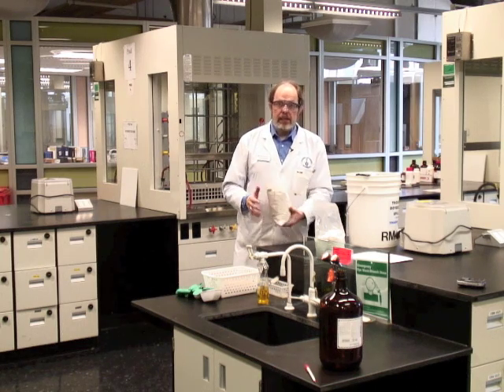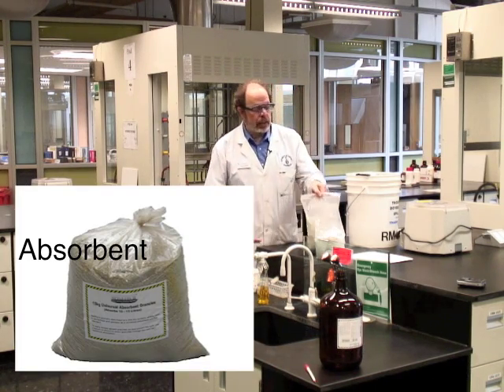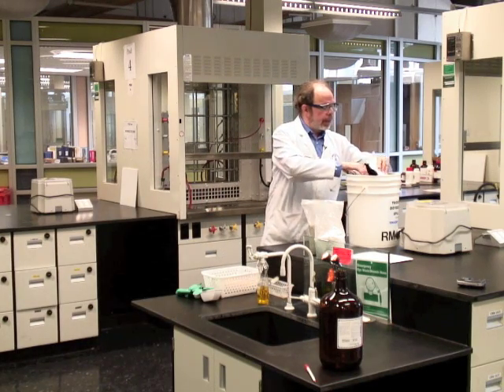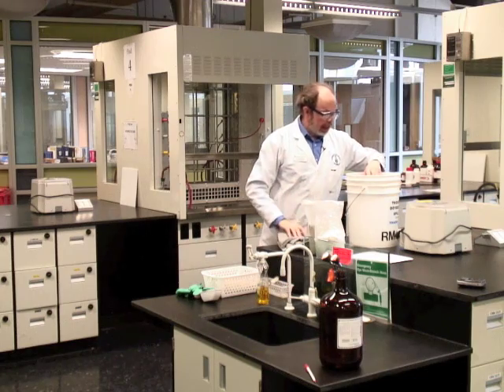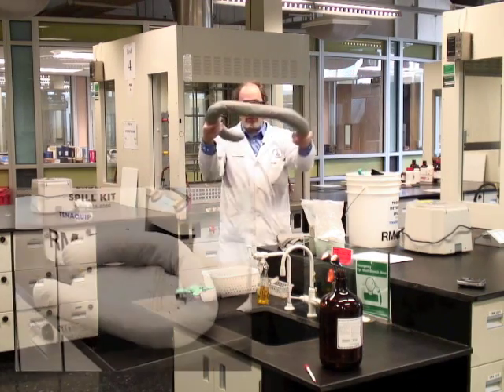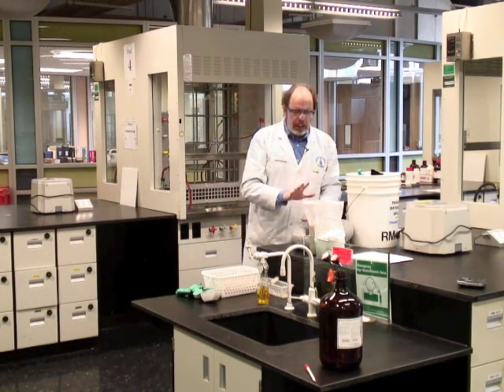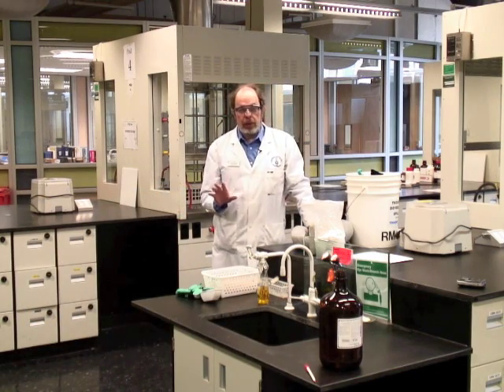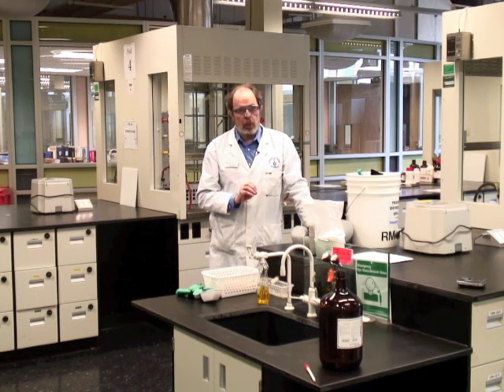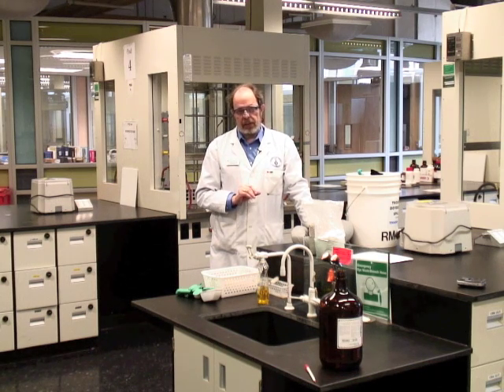If it's an organic solvent, we use the adsorbent — remarkably like kitty litter — and mop it up. Inside the kit there are mopping up pads and also devices that can be used to form a dam around the puddle itself. These materials, once they have been dealt with, will be put into bags and disposed of as chemical waste. But if something this size is needed, call for staff assistance.